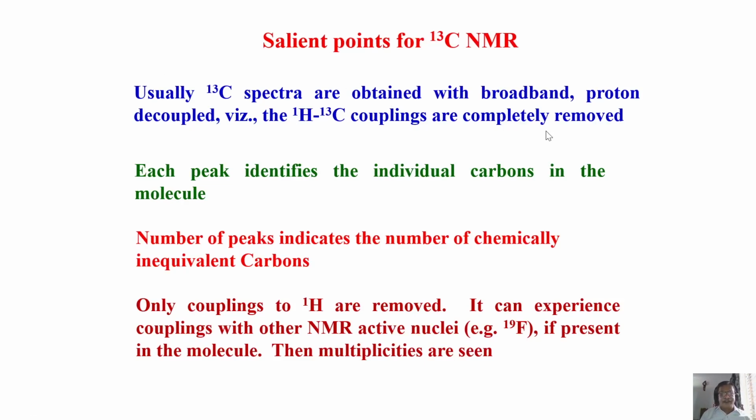You may be wondering, what is this decoupling? I have not introduced it yet. I will introduce it to you later. But please remember, in the case of carbon 13, we break the coupling of all carbons to all protons. Then what will happen? We will see later.